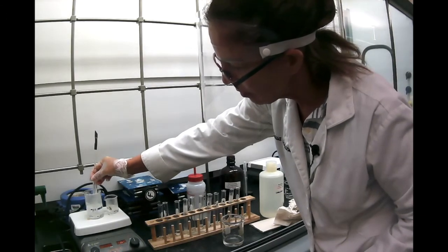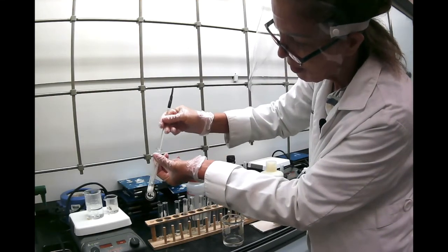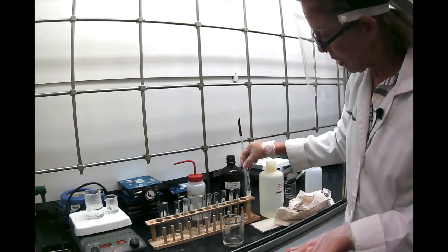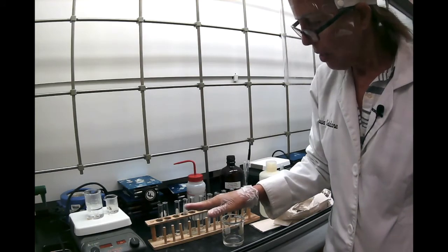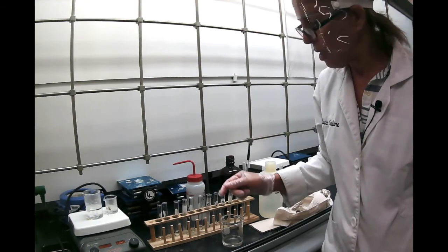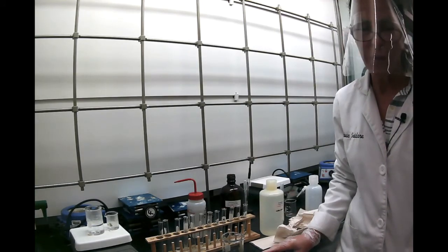Let's heat it a little bit. And it's still not soluble. So, what is the conclusion? In all of these, the only one that was soluble in hot is naphthalene. So that concludes the first part of the recrystallization lab.